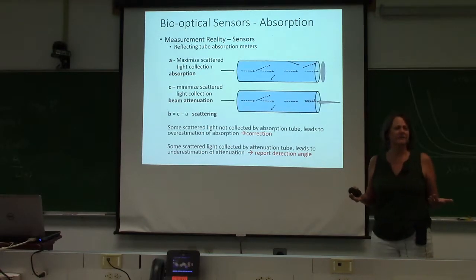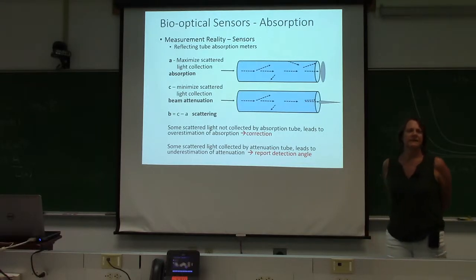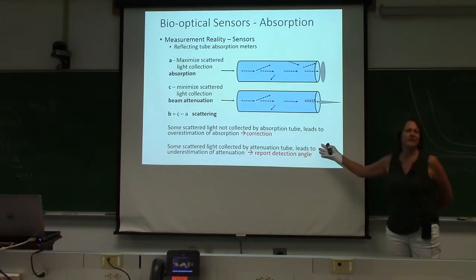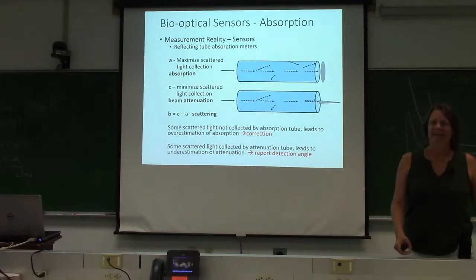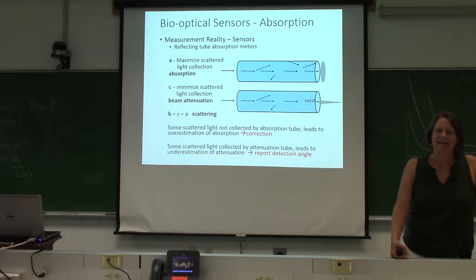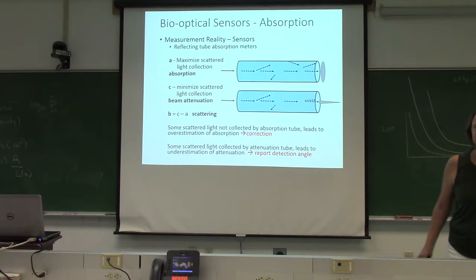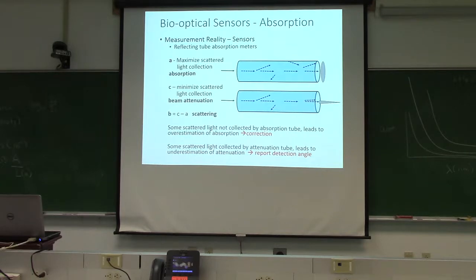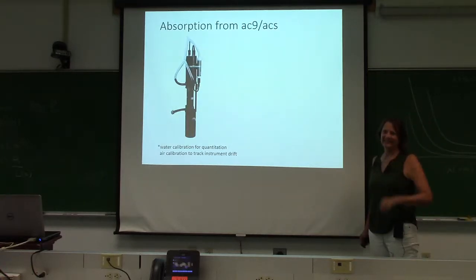Is there any correction factor? I don't know of one. Unless you know your volume scattering function. If you know your volume scattering function, why do you have an AC9? Exactly. Okay, so I have a paper. But you have to know the volume scattering function or estimate it. Yeah. We have a whole lecture on beam attenuation. We'll get to this. Upload your paper. I can't remember what the correction was, how much it was. Was it significant? Your volume scattering function.